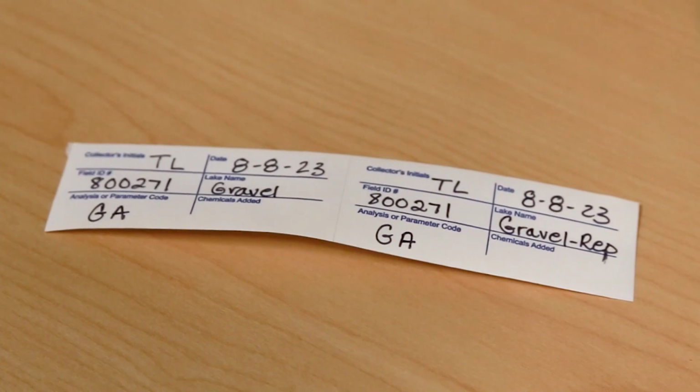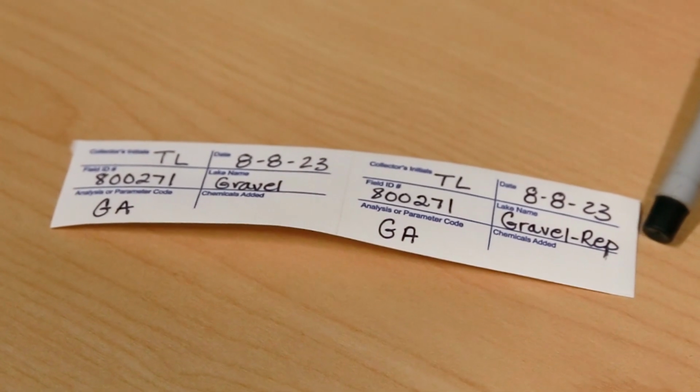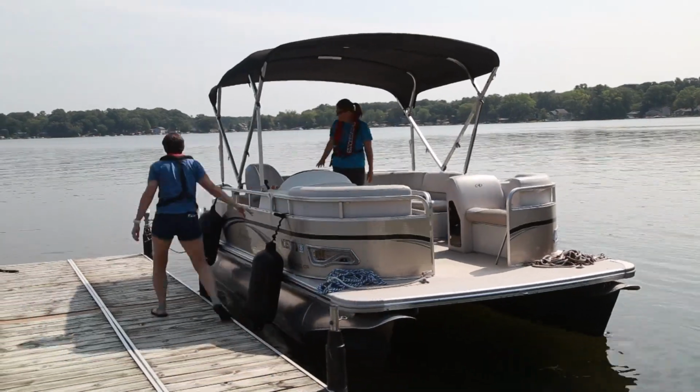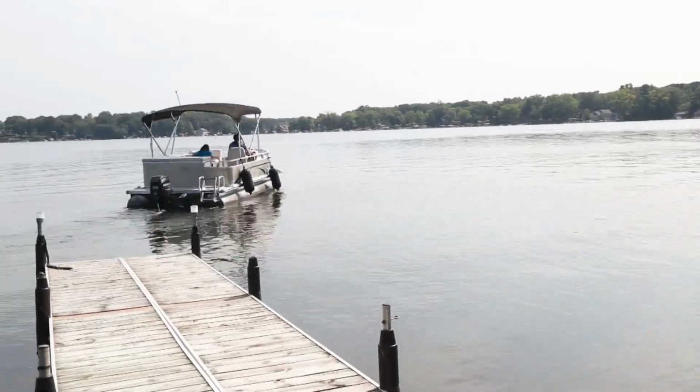You will do the same for the second sample label, but you will also write REP next to the lake name. This is short for replicate. Fill out the top of your data sheet and the map of the lake on the back of the data sheet. Next, proceed to your monitoring location, which should be over the deepest part of the lake.